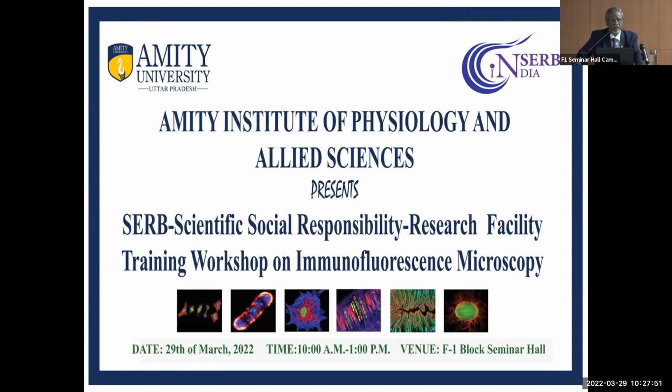On the slides, as you see, a fluorescence microscope is essential, from the simple fluorescent microscope to the confocal microscope, where you have the laser, and the FACS machine, the fluorescence activated cell sorter, where a variety of filters and lasers can be used according to your choice. Mostly it is the green fluorescence we see, which is derived from the jellyfish, which is autofluorescence. Many of the animals show autofluorescence.